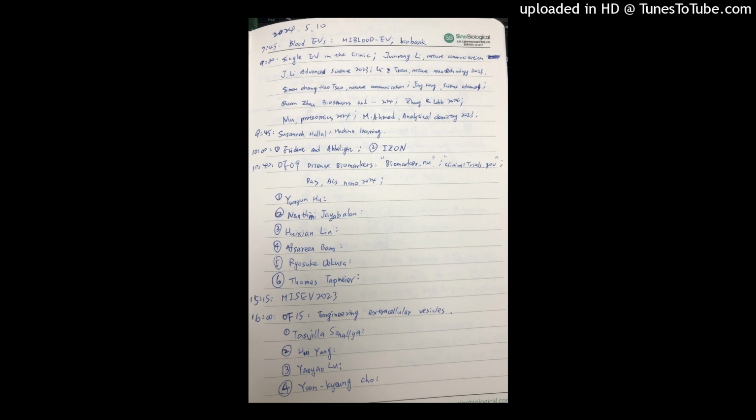So, that's good. Felicity Dunlop from Deakin University. So I have a question and I guess a comment. So we've started working with mouse plasma, and you can appreciate you get a lot less plasma out of a mouse than you do a person. So I think I'd like to see the guidelines include what's appropriate for a mouse. So you can't leave the top centimetre above your buffy coat because that's your entire sample. And I guess the other one is, we haven't started measuring platelets yet, or do we do a lot of centrifugation steps to remove them? Do you have a recommendation on the method to measure residual platelets in your plasma samples?